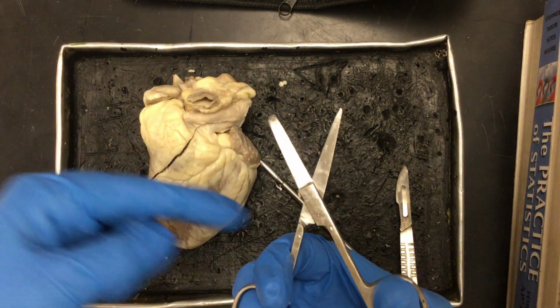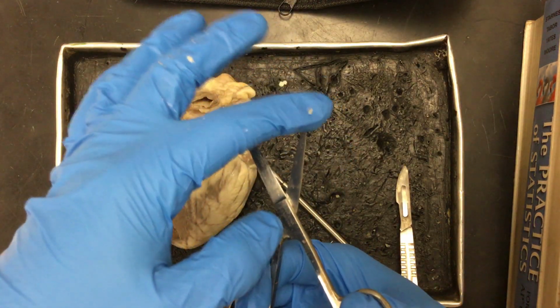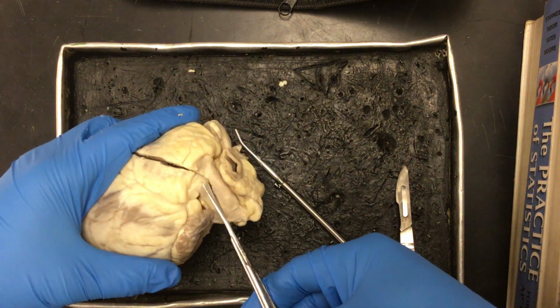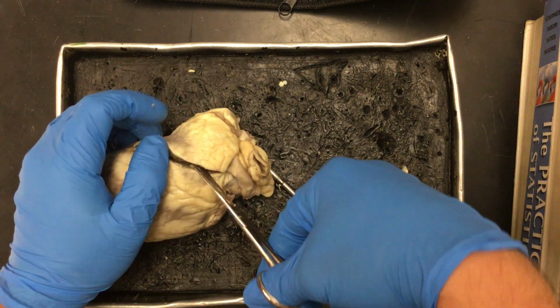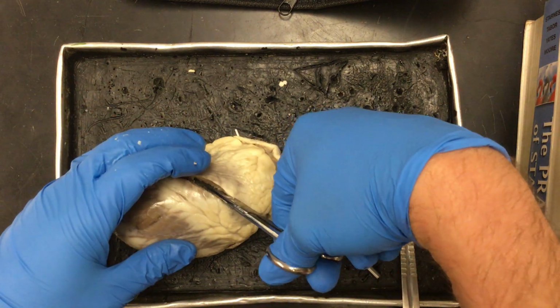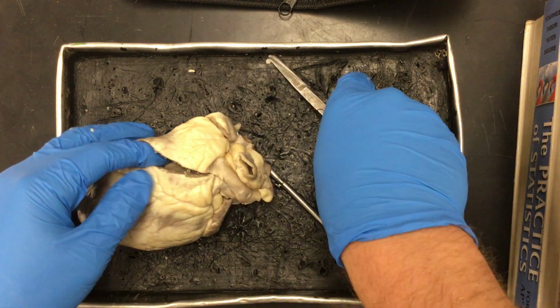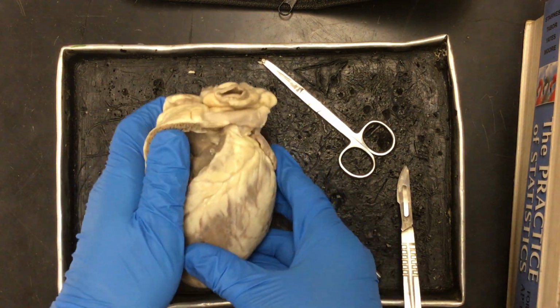Using these surgical scissors, they're rounded on one side to prevent any tissue damage, sharp on the other, so the rounded side goes inside. I'll cut along here, like that. They cut incredibly well, see that? To reveal the right ventricle.